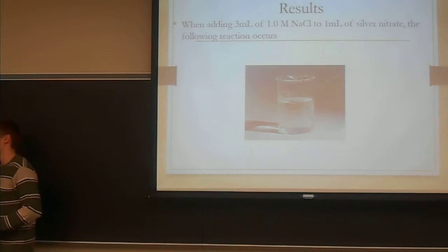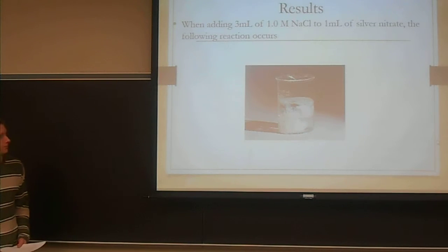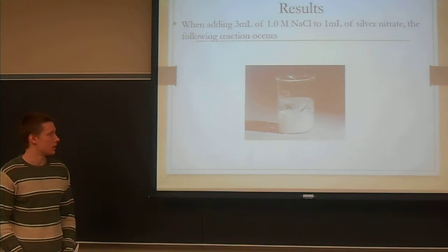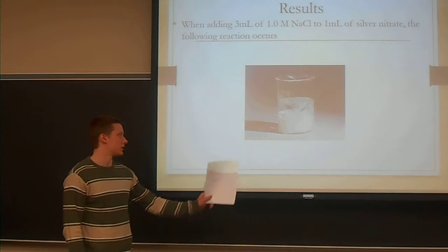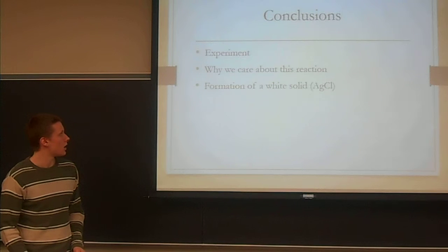So the results, this is the reaction that occurred. As you can see, it formed a white, cloudy substance, and there's also a solid that is forming in there.